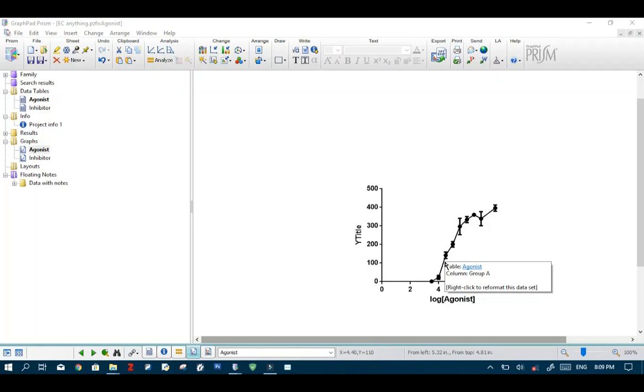GraphPad Prism comes with a cool set of functions to help us achieve this. So how do we do this?